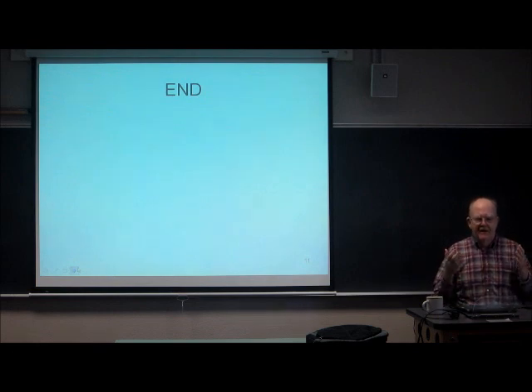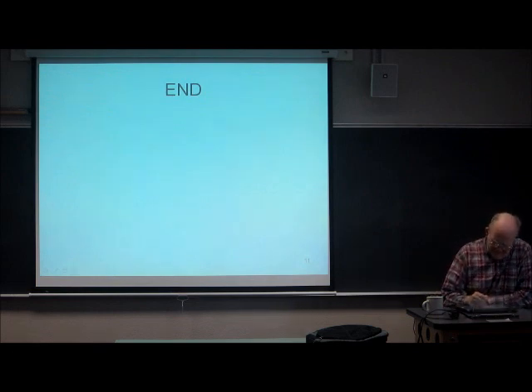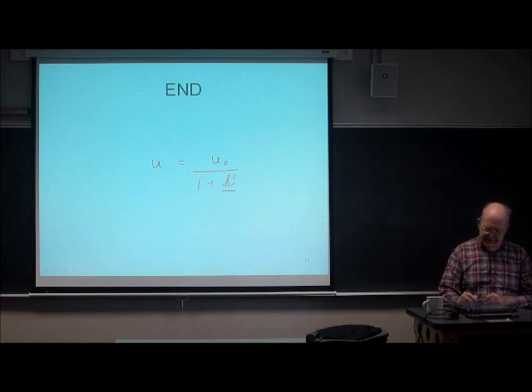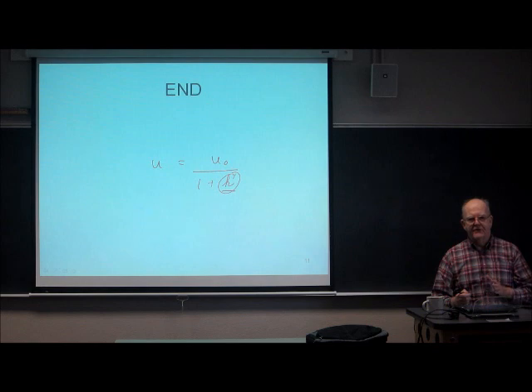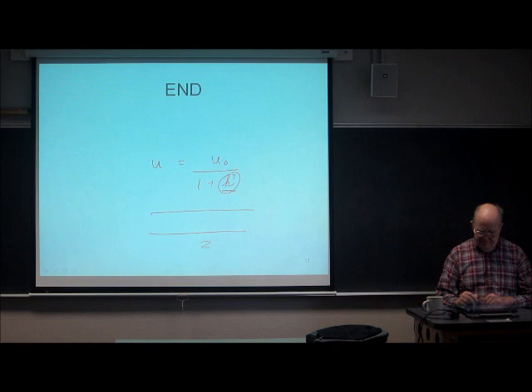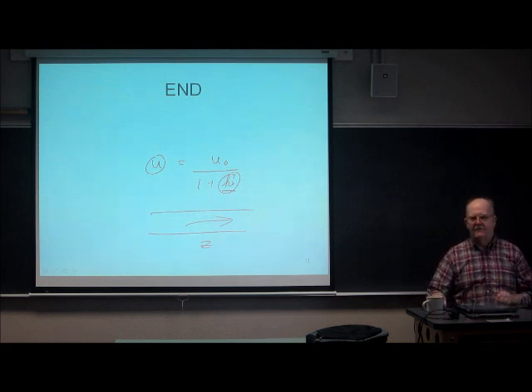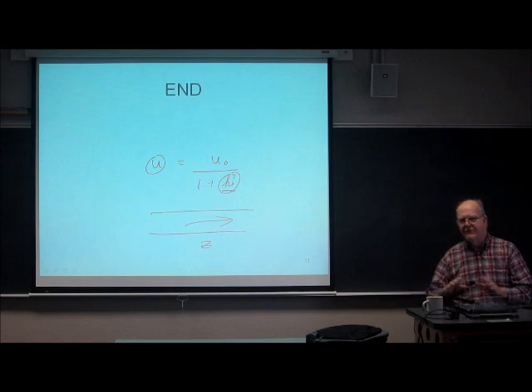It just impacts because the velocity is given by that equation, and this is varying with the concentration, the local concentration, meaning the concentration on the z-axis of the column is varying. So this is varying, so that is varying. Okay, it's not due to wall friction with the column at all. There are effects, but we're not worrying about them now, and they're much smaller than these effects.